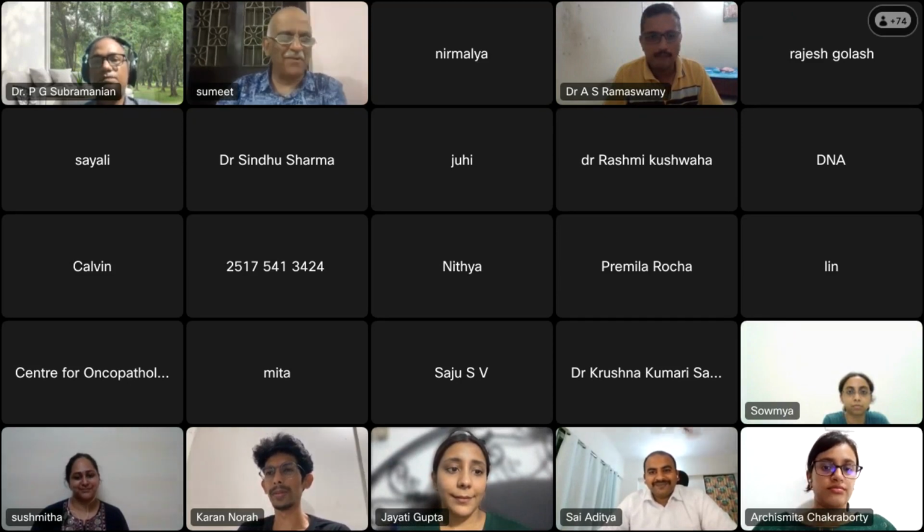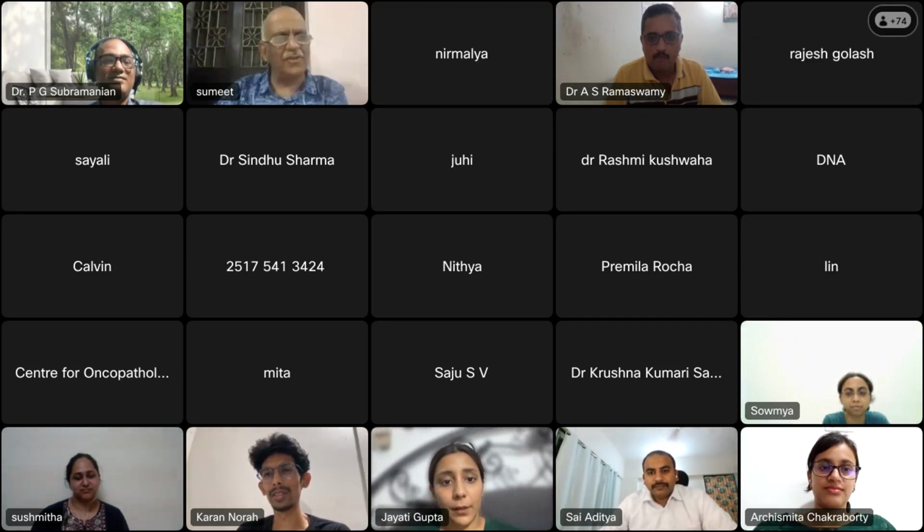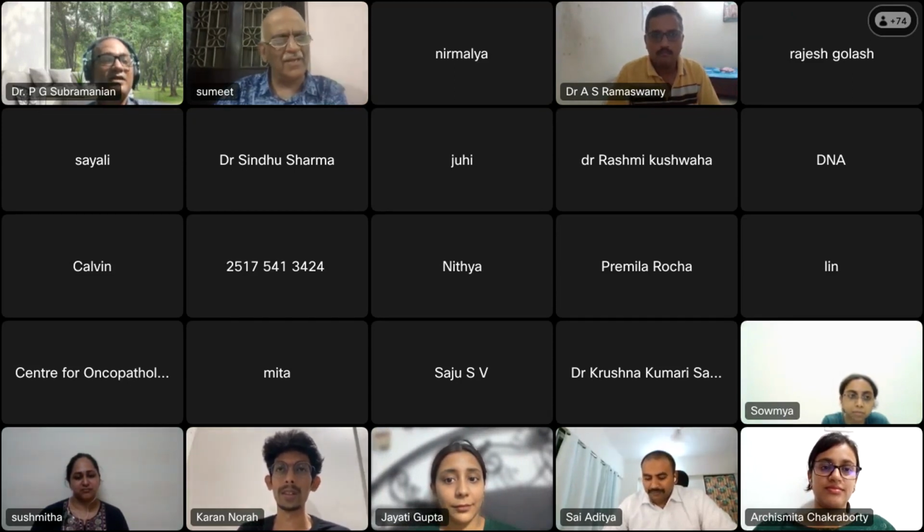The students are intimidated by so many colors. So Mani, what do you suggest? How many colors should you do for acute leukemia diagnosis? What instrument should a lab have? I mean, this is out of scope of this talk, but still, would you like to say 6 color, 8 color, or minimum? Anything you want to suggest?